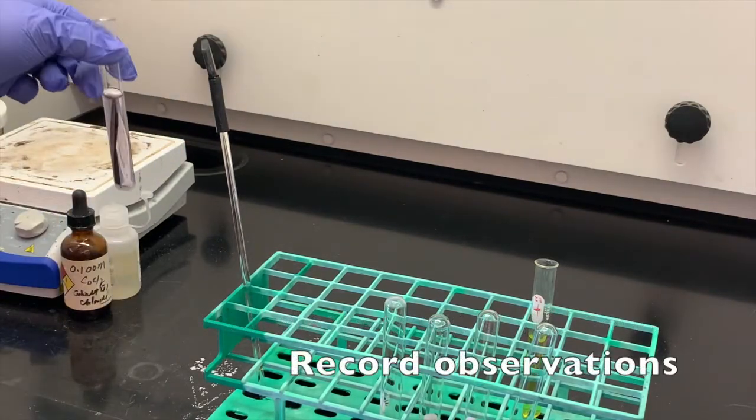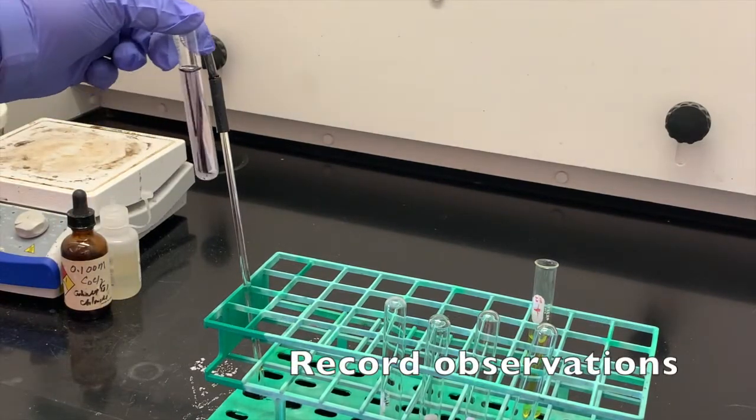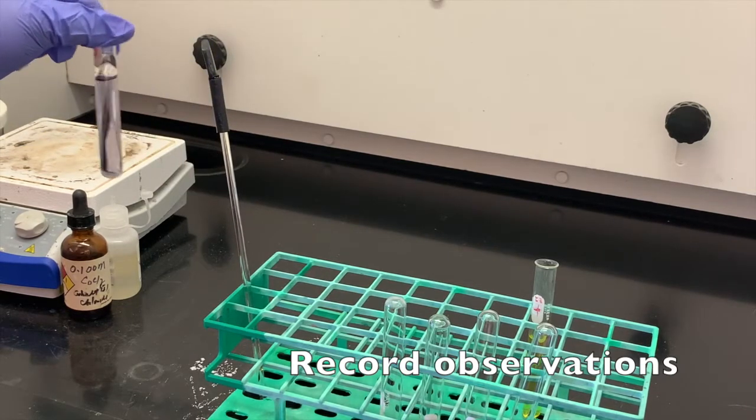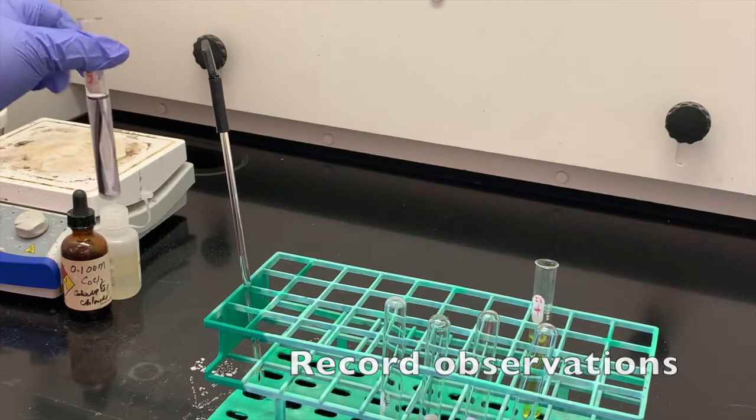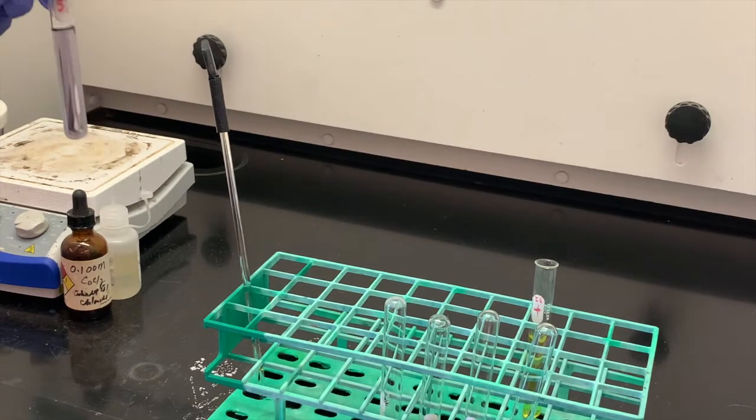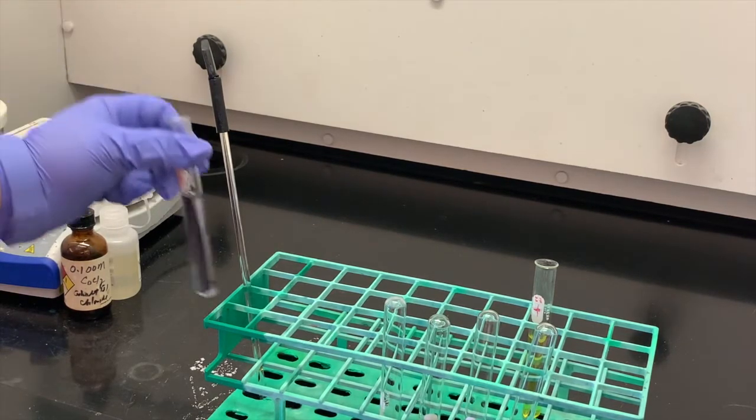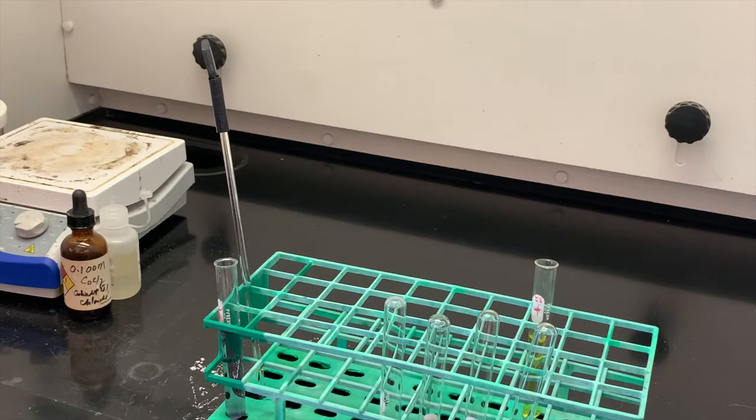Okay, so now we have seen a color change. Make sure you make your observations on what you see in this test tube. So it's gone from a pinkish color and now it is more of a purple color. Hopefully you can see that. Make sure that you record your observations in table one.